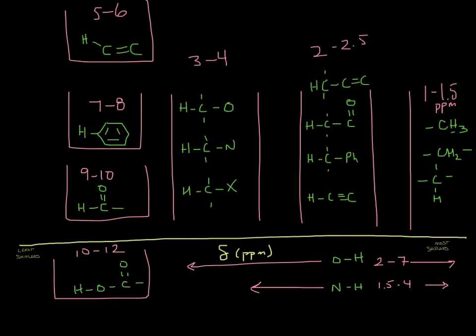With IR, we're looking at functional groups. That is to say, it tells us everything about carbonyls or benzene rings, etc. But what neither of those do is tell us about the location and environment of the carbon backbone. That is the strength of the NMR, as it tells us information about the carbon backbone. So the location of these peaks, this so-called chemical shift, is actually one of about 4 discrete things that you can learn by looking at an NMR spectra. It's the simplest, so it's what we're going to start with, but with NMR there's a lot to unpack, and that's why we split it up into 5 different lectures.